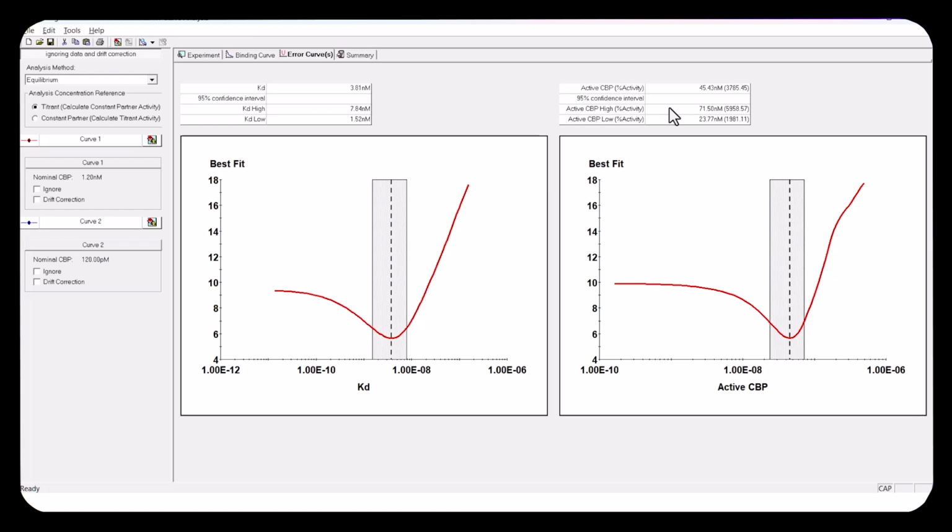If it does, that means that your whole analysis is sensitive and really ultimately based on one data point. If that's happening, I don't want to use either ignored or not ignored in that case. I want a different experiment where I'm not relying on a single data point, where the importance of the fit is spread across the curve instead of relying on a single point or even just a small handful of points. So this looks okay to me.